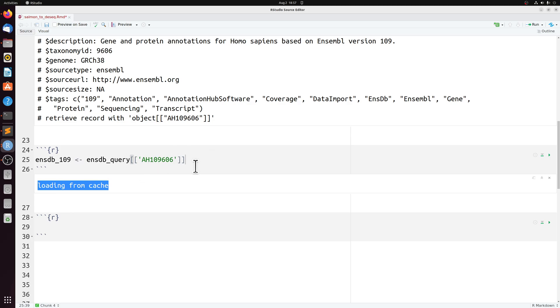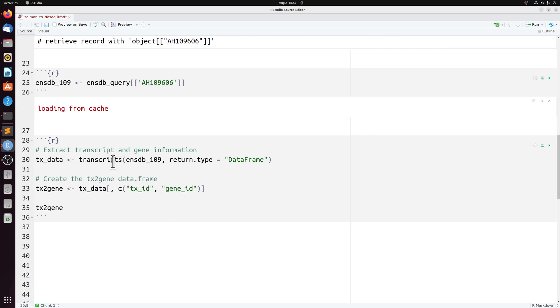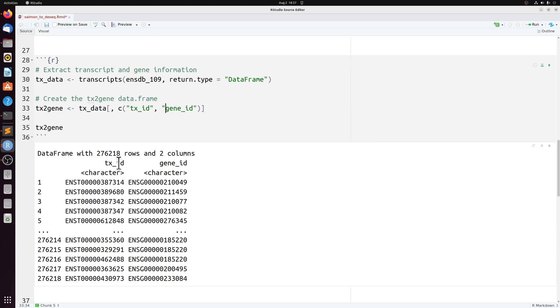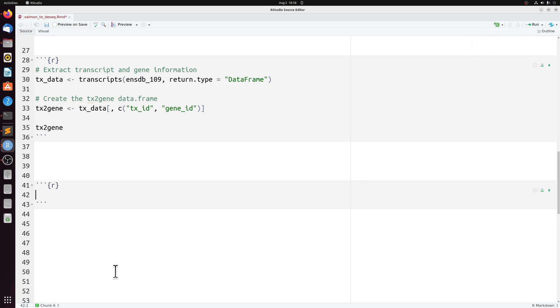And then we're just going to convert this into a simple two column data frame. So we're just getting the TX ID and the gene ID. So our TX ID is the transcript ID and then the Ensembl gene ID.